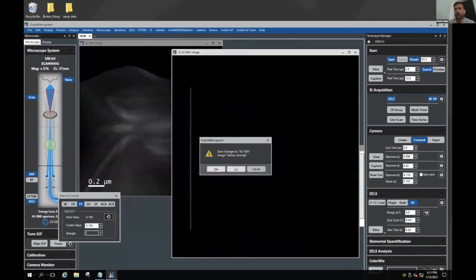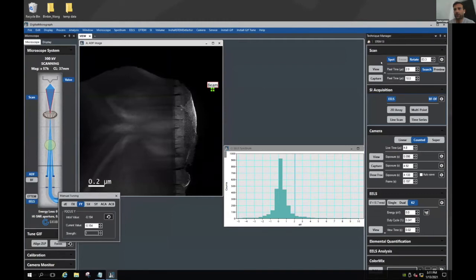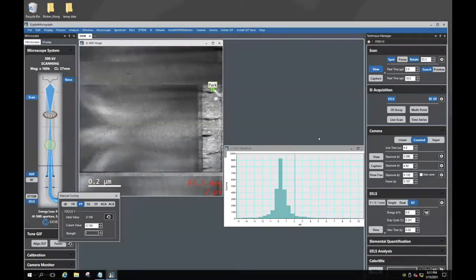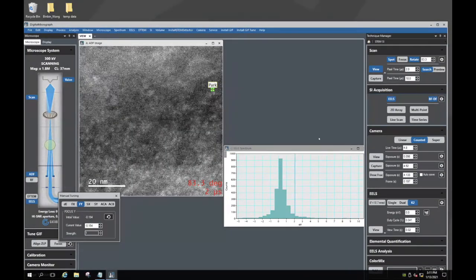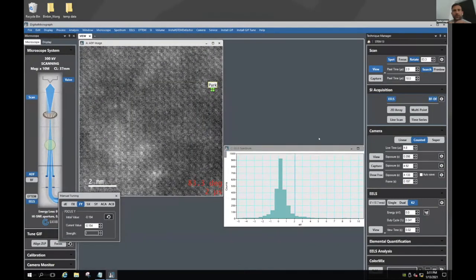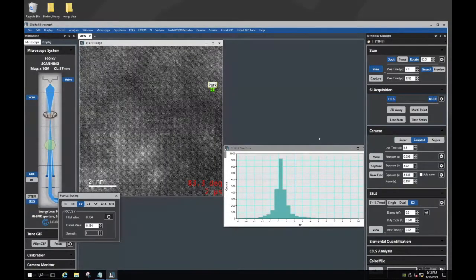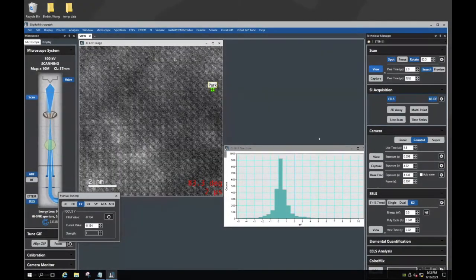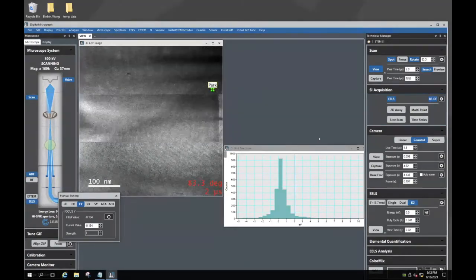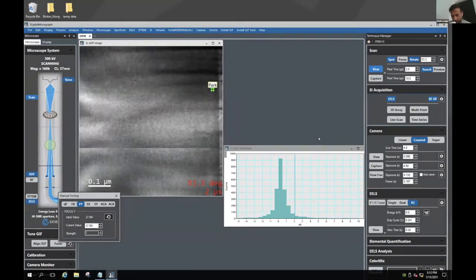Okay. All right, Robert. So now let's go up in magnification. Let's do some fast mapping. Yes, sorry. Yeah, let's go up in magnification. Now let's look also there. Oh, you want to do atomic scale directly. Did you change? Oh, we changed camera length. The alignment looks like it's off a little bit. No, I'm not trying to do atomic scale. No, you want to go to the interface. Yeah, let's do some fast mapping. We'll do atomic scale as well.